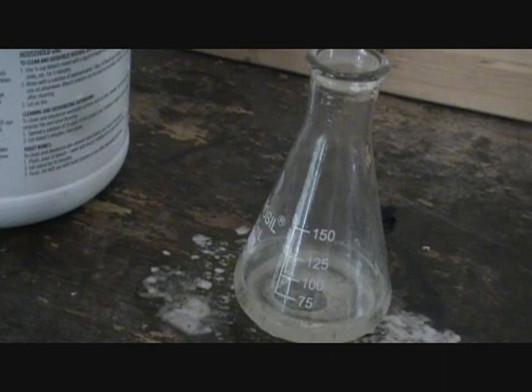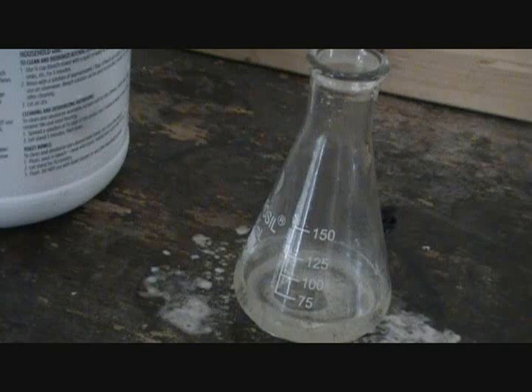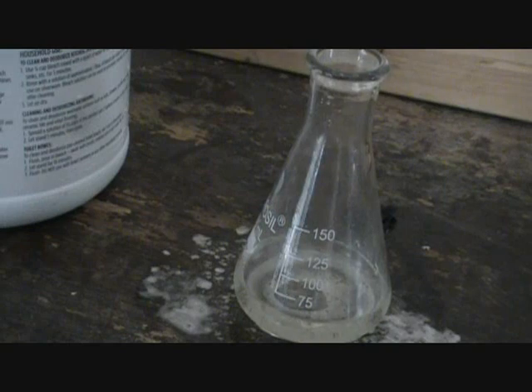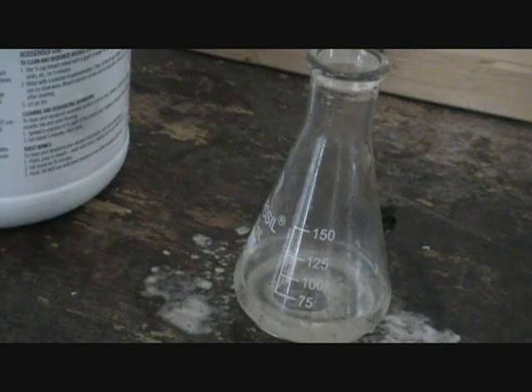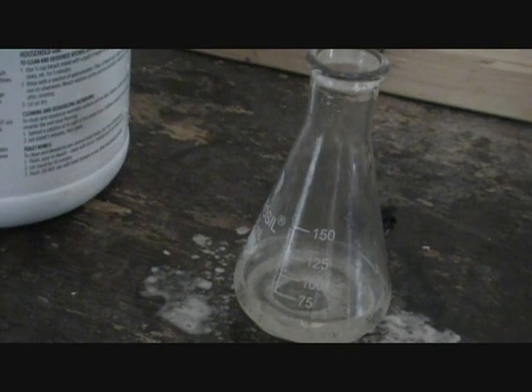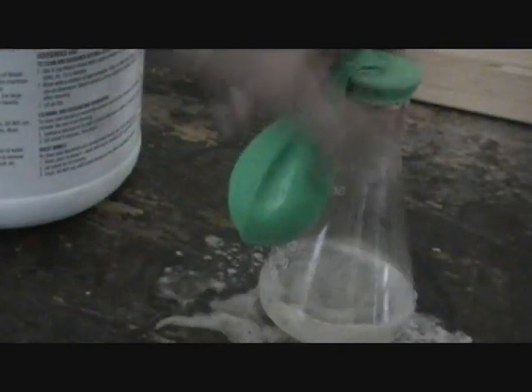We'll try that one more time. 20 ml. And you should be using 30% hydrogen peroxide. I don't have any 30% hydrogen peroxide; I'm using the regular 3%, but you should be using 30%. It's probably not going to make the same reaction all the way.